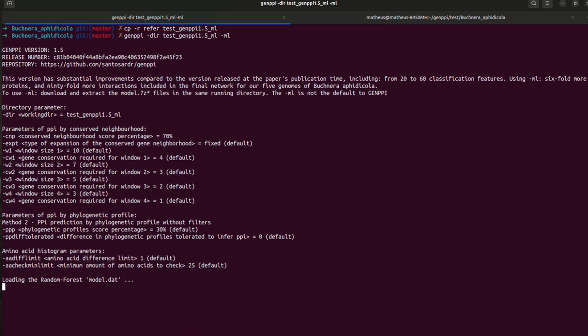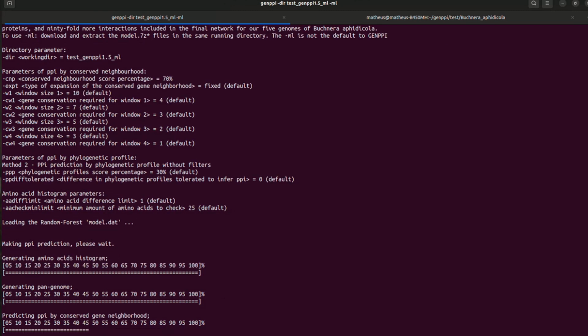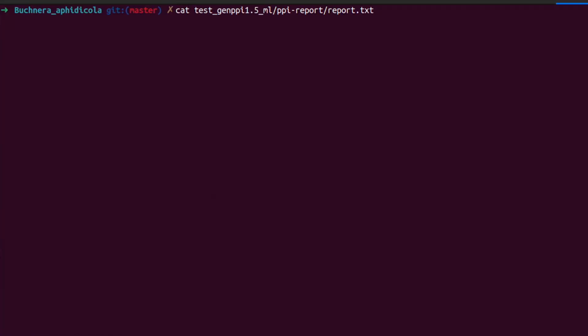This is normal. Starting to analyze. Okay, it's over. Now let's look at the data and see if it was worth taking a little longer.